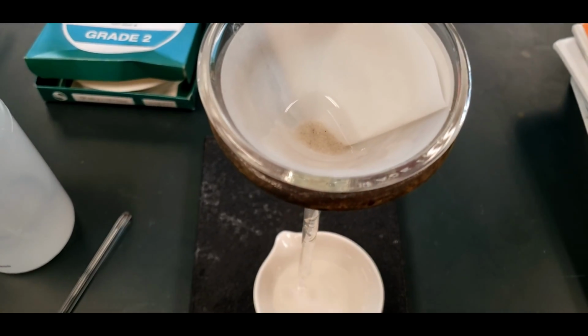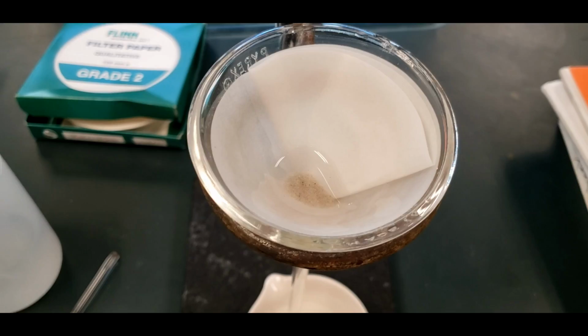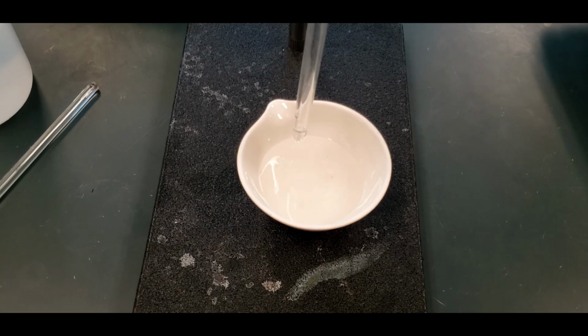So I'll give that another 5 minutes, and then we're going to put the sand and filter paper into the oven, and then we're going to start evaporating off this massive amount of salt solution. Okay.